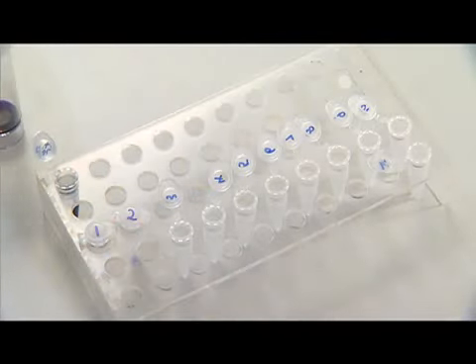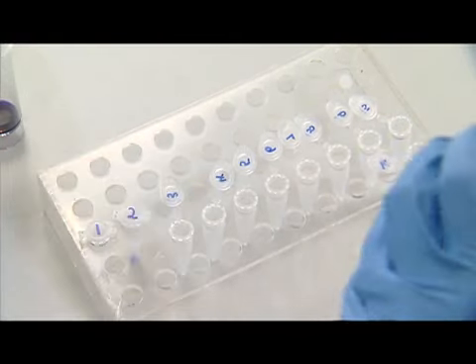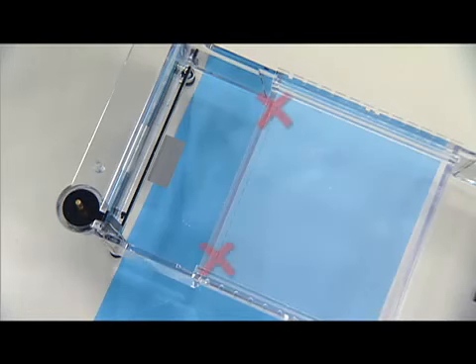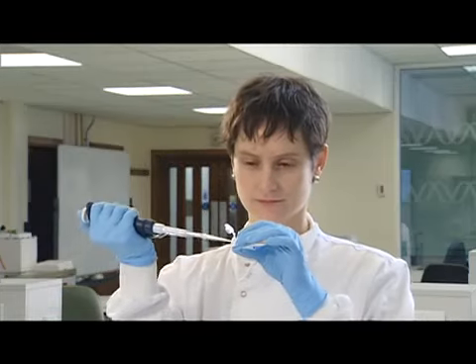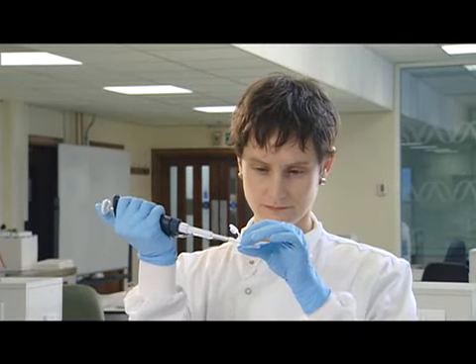Arrange labelled tubes containing samples in the same order that they'll be loaded into the wells. If there are more wells than samples, avoid using the outermost wells. Samples loaded on the edge of a gel tend to run less consistently than those loaded closer to the centre. The volume of sample loaded into the wells will depend on the capacity of the well. 10 to 20 microlitres is typical.